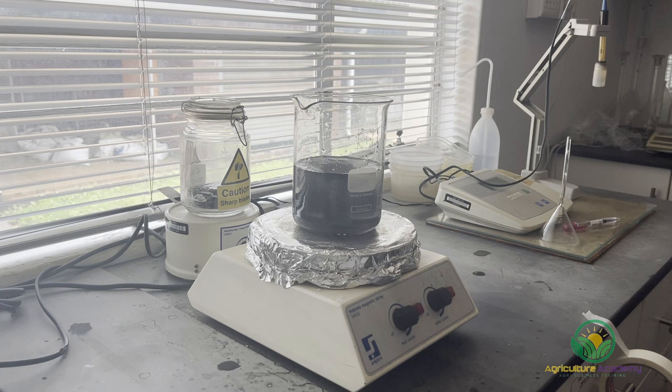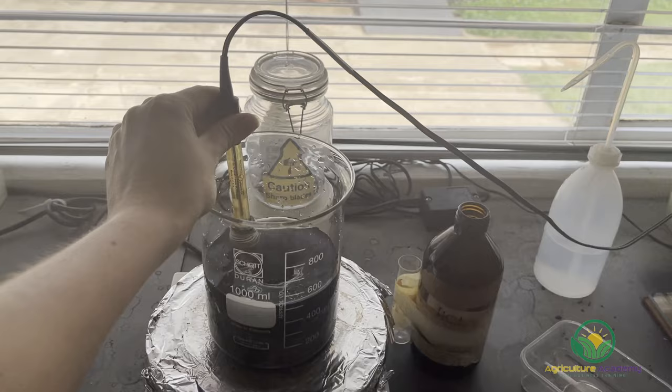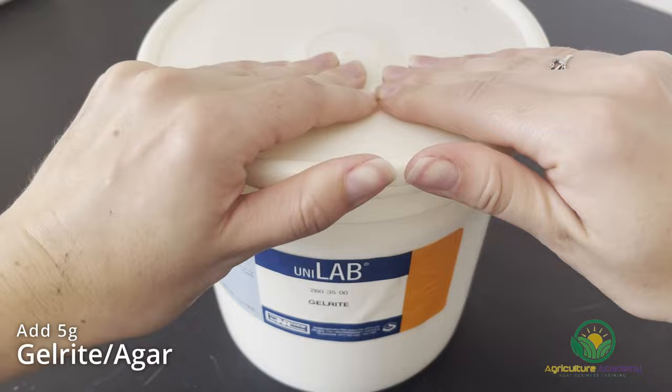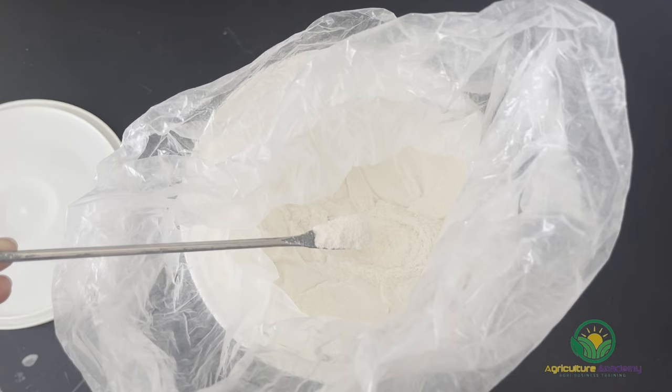Next, we have to test the pH. This is tricky to do at home, but is mostly required to make sure the medium can solidify properly, so don't worry too much if you can't complete this step. We had to lower the pH of our medium to around 5.3 with a few drops of hydrochloric acid. The final addition to our medium was 5 grams of gelrite, the substance which will help the medium solidify. Agar can also be used. You can either purchase these compounds from specialist retailers, or try use gelatin in their place.